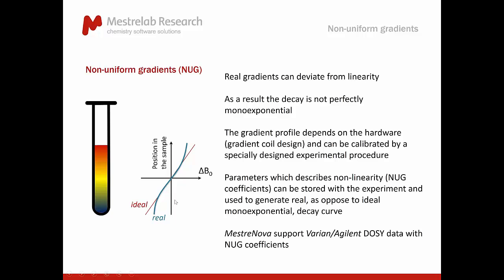As a result of that, the decays which we see in our DOSY experiments no longer follow a perfect mono-exponential decay, right?